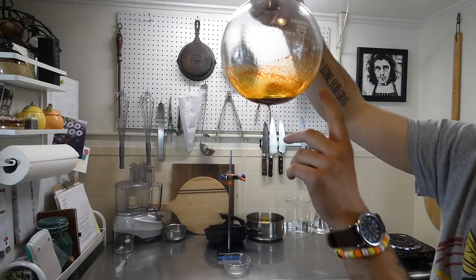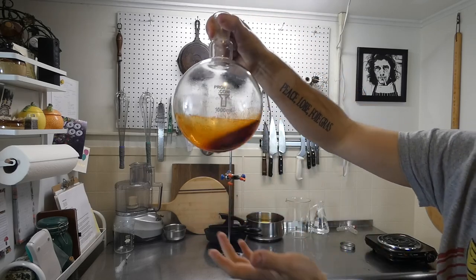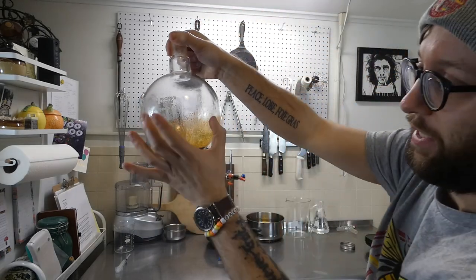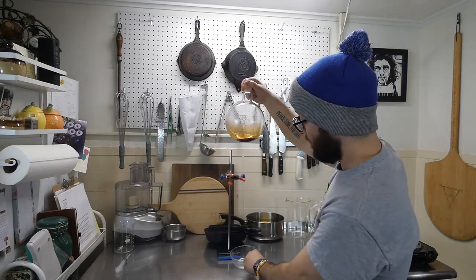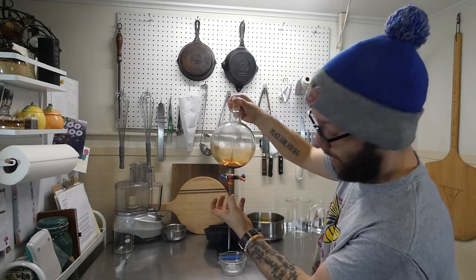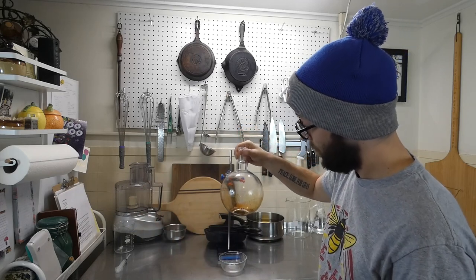As you can see, there's this red oily substance coating when I shake it. That is the capsaicin oil. So we're going to empty this into this container here and let it drip for a bit to get it all out. Then we'll let it set for the ethanol that's in here to evaporate, and then we're done.